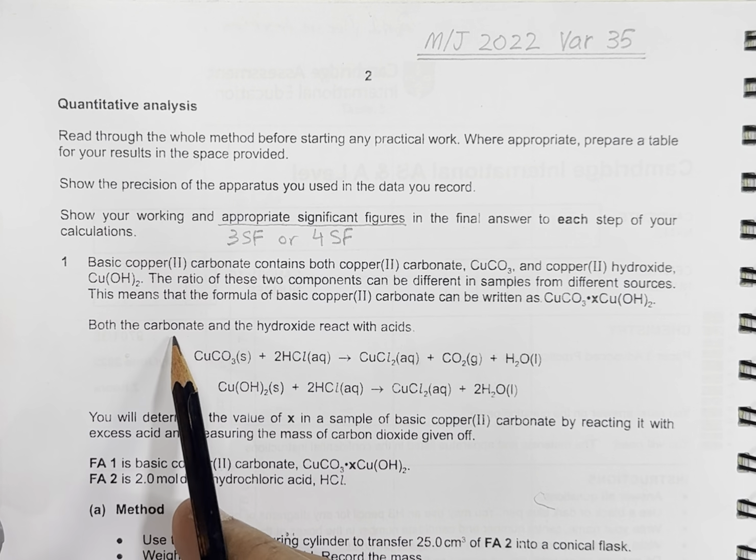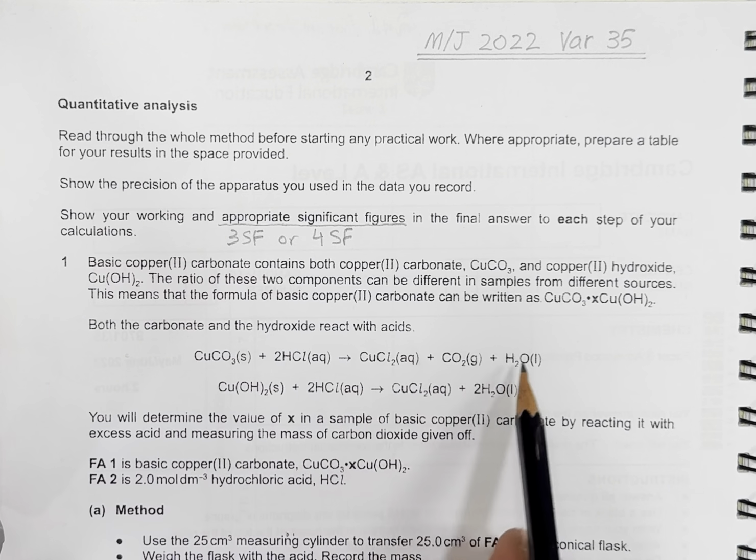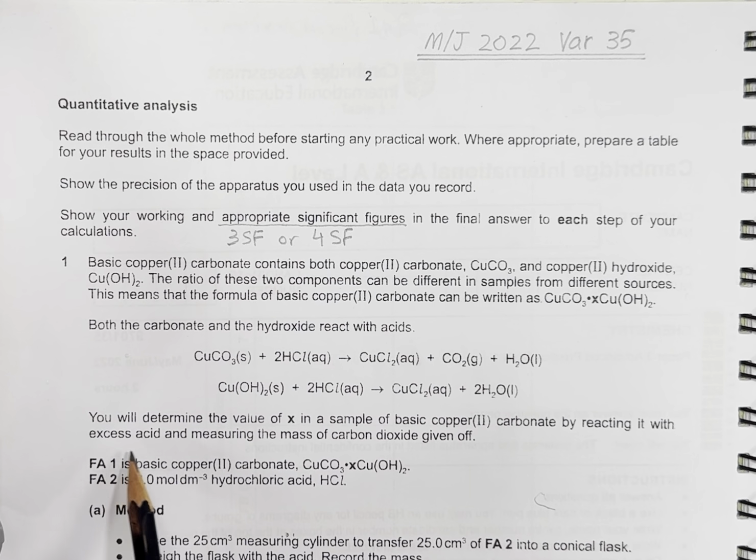Both the carbonate and hydroxide react with the acid according to this equation. You will determine the value of X in the sample of basic copper 2 carbonate by reacting it with the excess acid and measuring the mass of carbon dioxide given off. Fa1 is basic copper 2 carbonate and Fa2 is 2 molar hydrochloric acid.